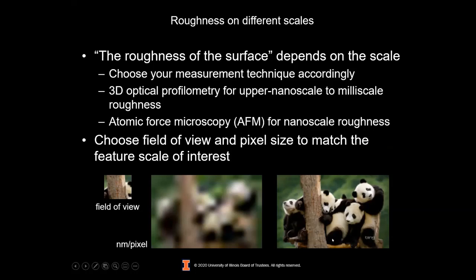But on the right, you have a larger field of view, but the same resolution. So you're getting the same quality of information, but over a larger distance. So if you were to just switch from the small field of view to a large field of view, but keep the same number of pixels, then suddenly this, let's say, 100 pixels is spread out into a distance that's like 5 times as large. So you essentially cut your pixel resolution by a factor of 5 in that particular example.